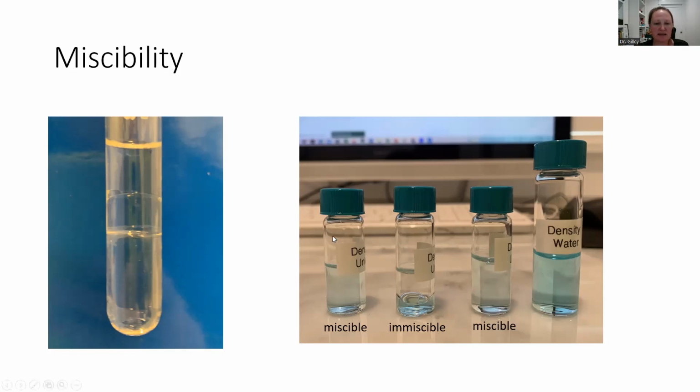So here are the three substances that are left behind. Notice that I already took some out for each substance to make my density tower. And whatever's left behind in the vial, I added some of the colored water to see if it was miscible with the substances.